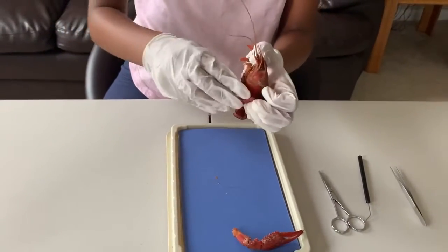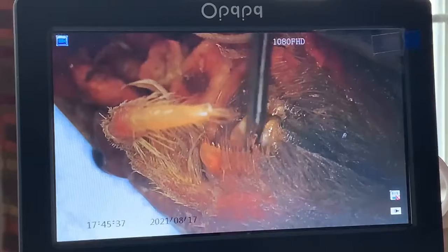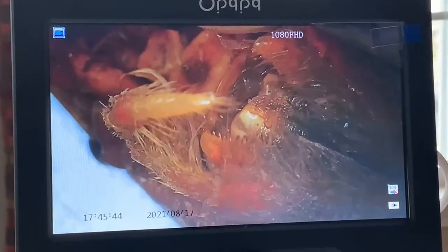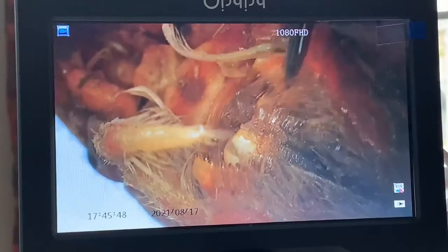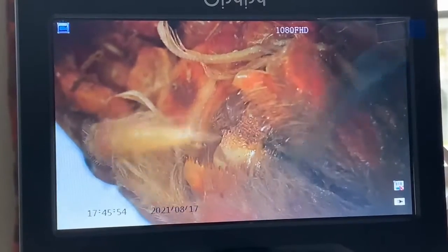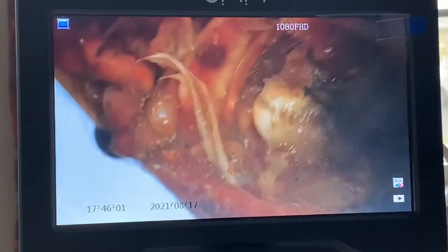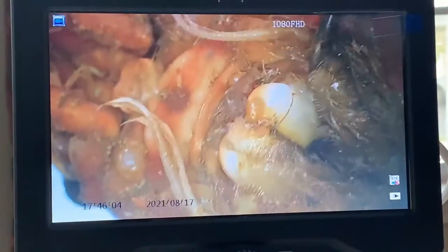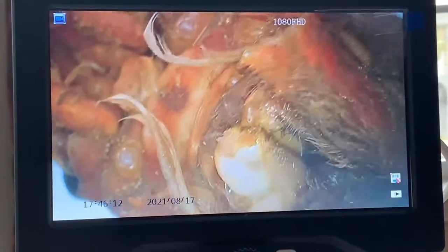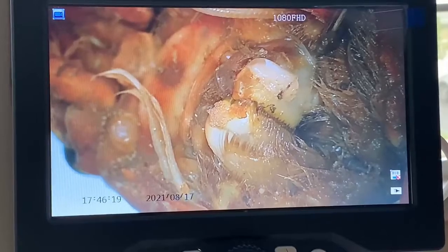Now let's get a closer look at the mouth. I have an enlarged version of the mouth region on my digital microscope. The first structure to notice is the maxillipeds — the job of the maxillipeds is to push the food into the mouth. Underneath the maxillipeds, you can see two white spots — these are the mandibles. The job of the mandibles is to grind up the food.